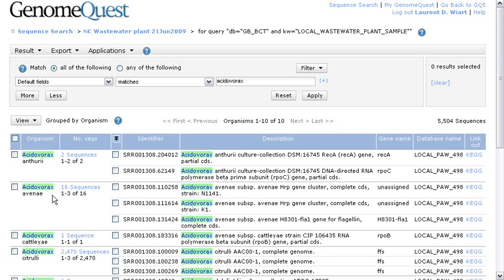And what we'll see is a total of 5,000 sequences annotated by acidovorax sequences. And you see the several strands in this list.